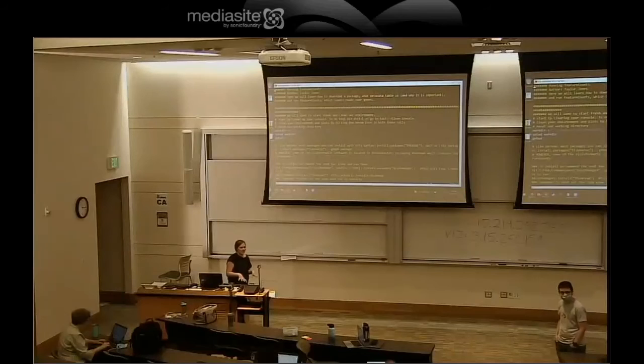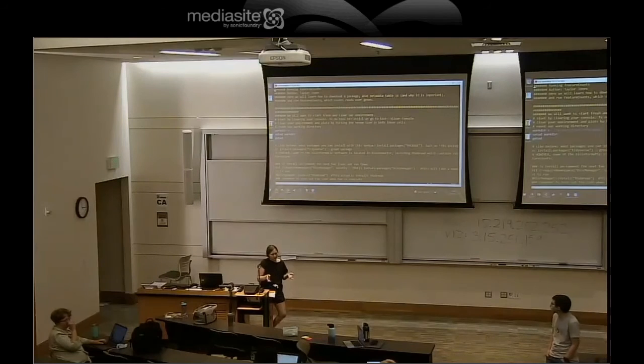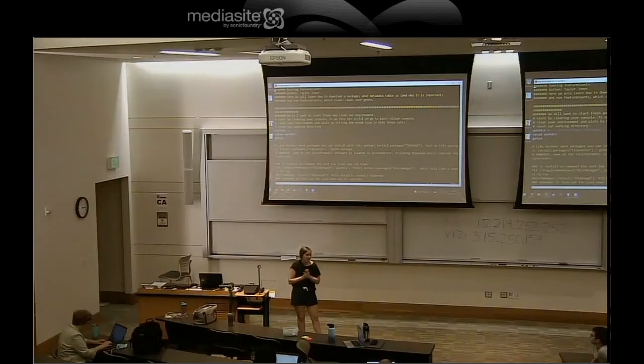Like Mary said, BAM files are really big, so you want to run featureCounts, which is really saying: you have all these reads in your BAM file, here's gene A, how many reads are on gene A? You're counting. These count tables inform which genes are differentially expressed. You can also look at histograms of counts, and you'll use your count table for the normalizations you do in data processing in general. So it's a really important step.